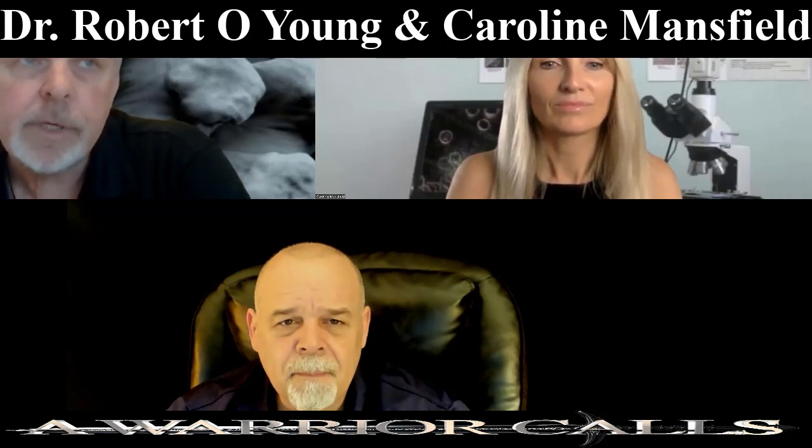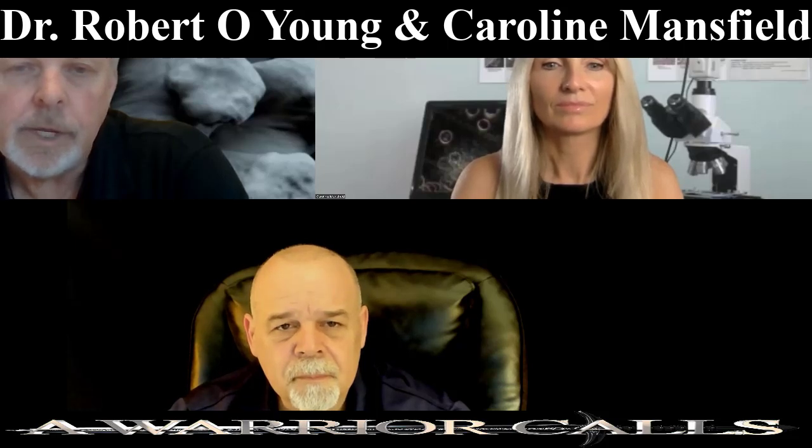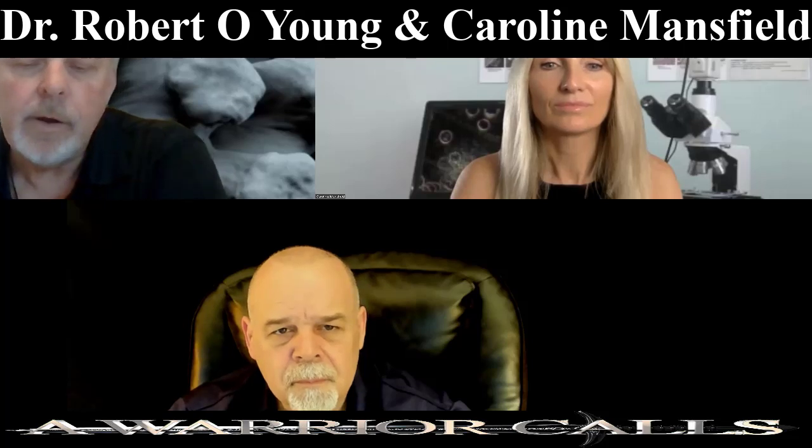Yeah, as far as the size of that, in order to really see their structures, you need to use some sort of bright field optical, scanning or transmission electron microscopy. And in looking at those little particles that Caroline was showing, magnified hundreds of thousands of times, you can actually see their structures. And the structure of the zeolite, this is the structure here behind me, a micrograph I took several months ago. So you can see that there are structures of that.